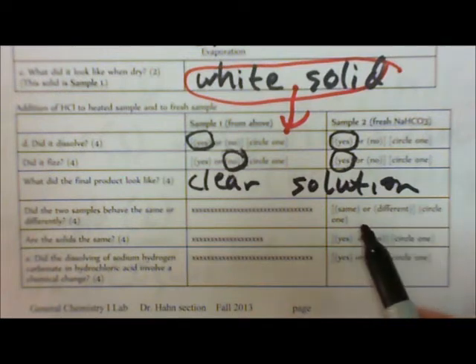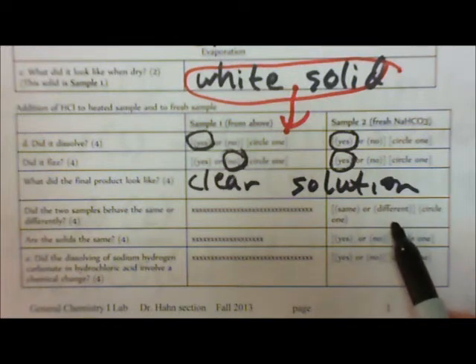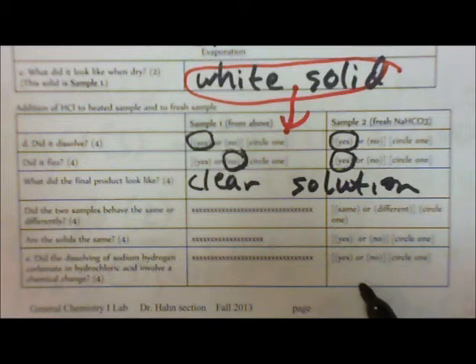Then you're going to answer, did the two samples behave the same or differently? You're going to circle one or the other. Are the solids the same? You're going to say yes or no. You should be able to make a conclusion based on the results that I gave you above. Did the dissolving of the sodium hydrogen carbonate in hydrochloric acid involve a chemical change? You're going to say yes or no.